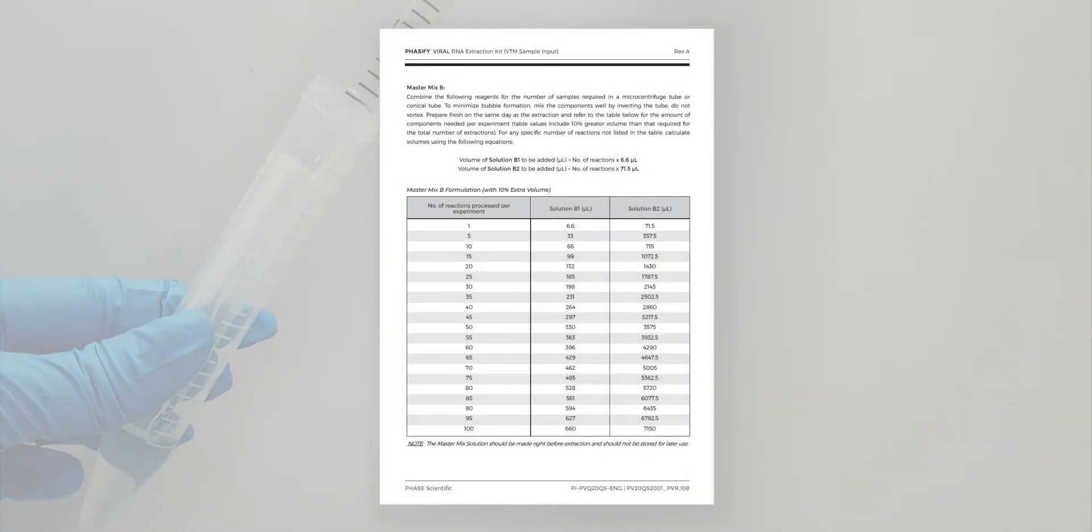Next, prepare Master Mix B by adding solution B1 and solution B2 into a microcentrifuge or conical tube. Please check the Master Mix B formulation table found inside the kit to determine the exact volume of reagent you should add depending on how many samples you intend to process.